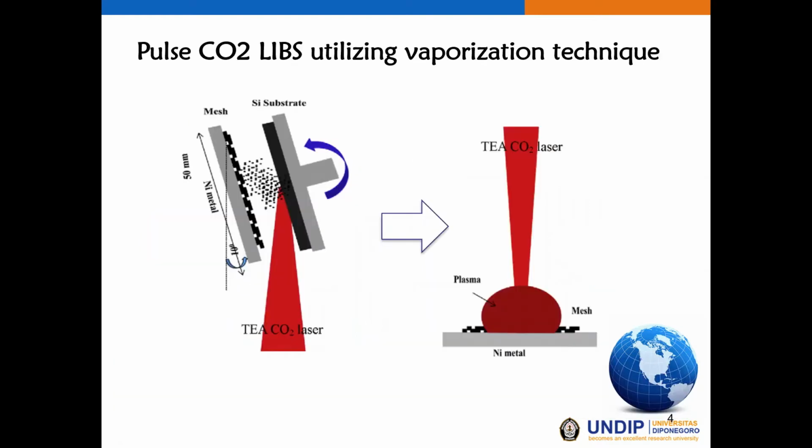In this present work, we offer a new technique of LIBS utilizing a pulsed CO2 laser with a vaporization technique. This is the setup of our technique. The setup consists of two steps, namely the vaporization technique and the acquisition technique.